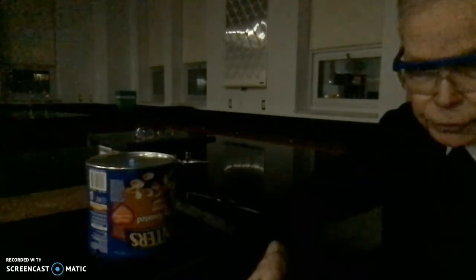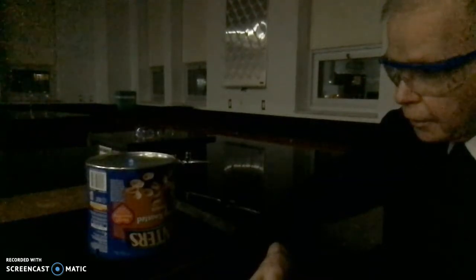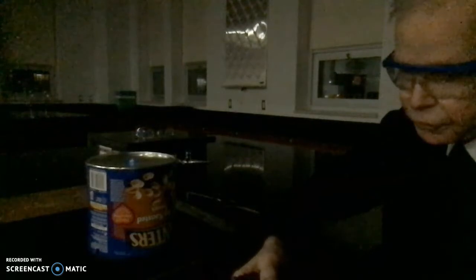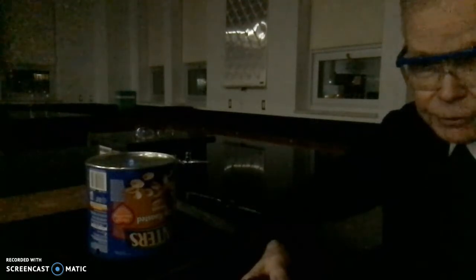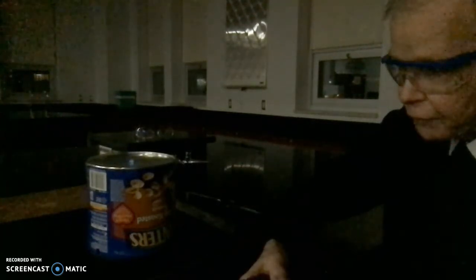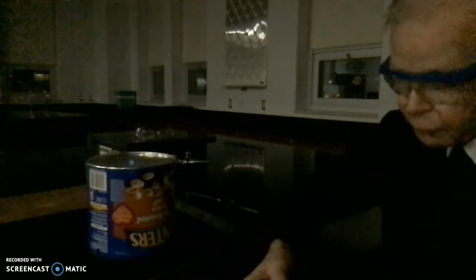I've moved the computer camera a little closer to the can, and you can see the flame has diminished a good bit. Checking my stopwatch, I know we're getting pretty close to the point where our combustion will be complete. Fortunately, this evening, the air system isn't as pronounced, so there aren't very many drafts in the room, which could possibly extinguish the little flame sitting on top there. So we have a little bit more time left.